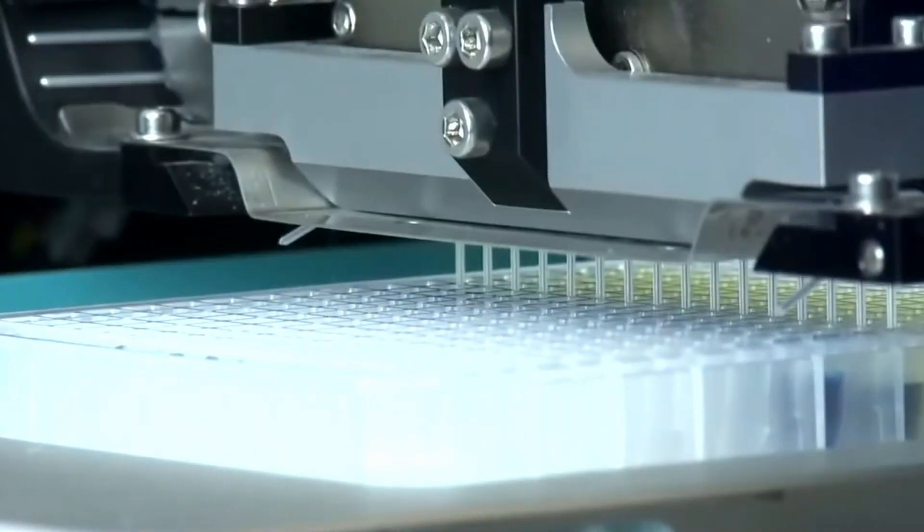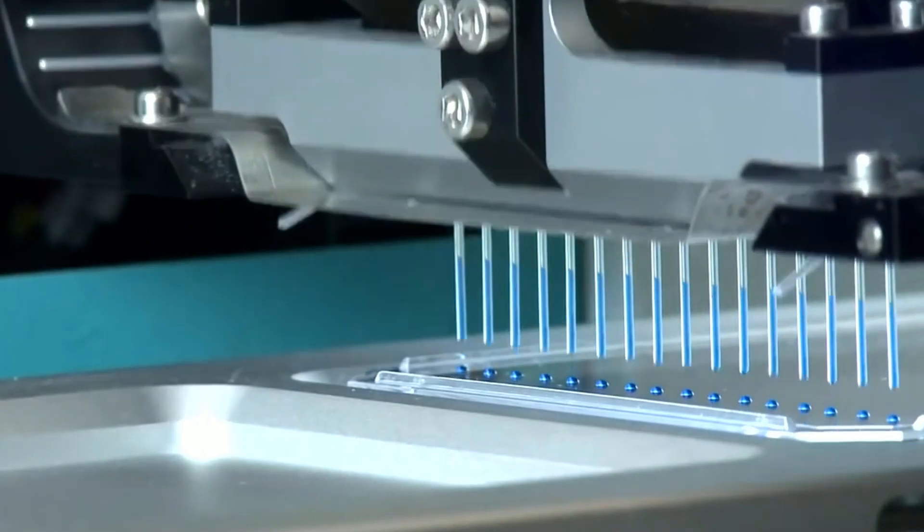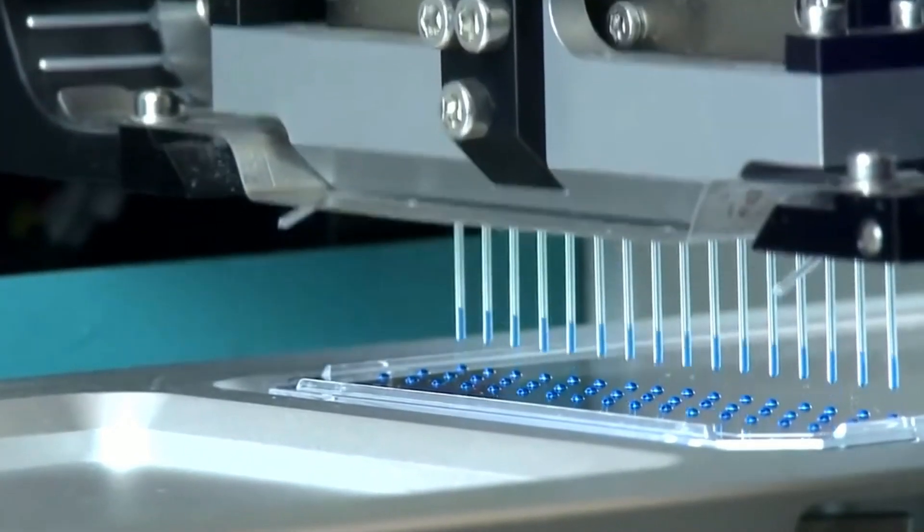This, coupled with rapid plate-to-plate transfers across three available deck positions, enables a miniaturized reaction to be set up in less than 5 minutes for 96 samples.